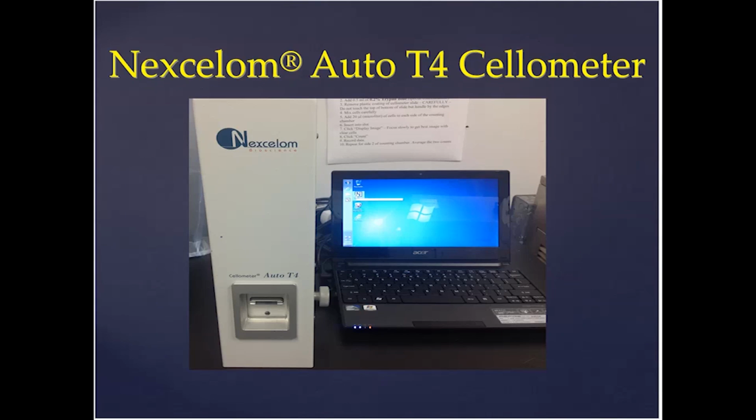Now let's move on to the next method that we use in our laboratory and teach students how to use, and that is using a piece of equipment called the Nexcelom Auto T4 Cellometer by a company named Nexcelom Bioscience. It basically looks like a metal box. It's about a foot tall.